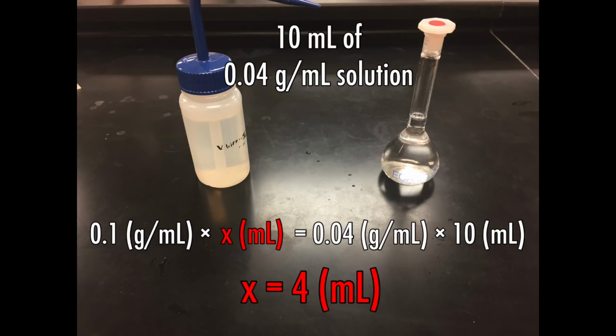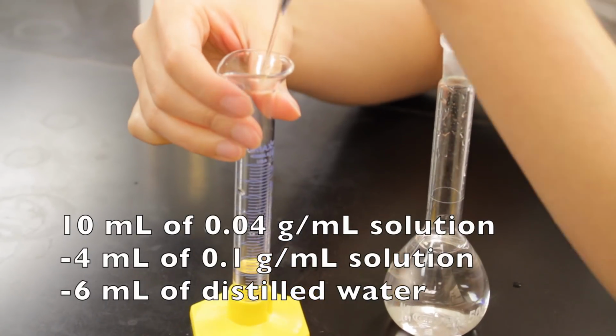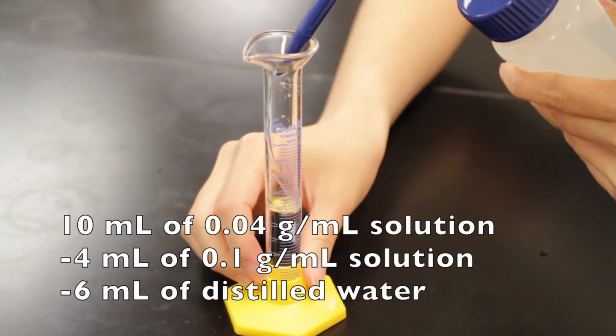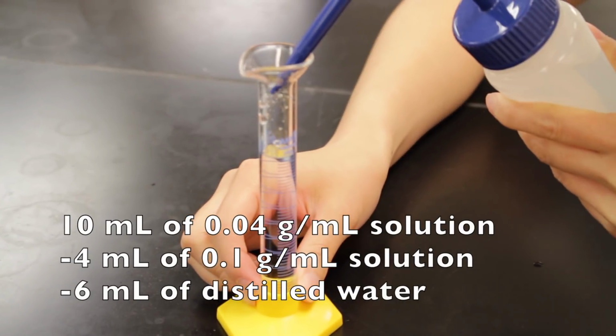So now we know that we need to add 4 milliliters of the original solution and 6 milliliters of distilled water to make 10 milliliters of 0.04 grams per milliliter solution. Using a graduated cylinder, measure 4 milliliters of 0.1 gram per milliliter solution and 6 milliliters of distilled water to make 10 milliliters of 0.04 grams per milliliter solution.